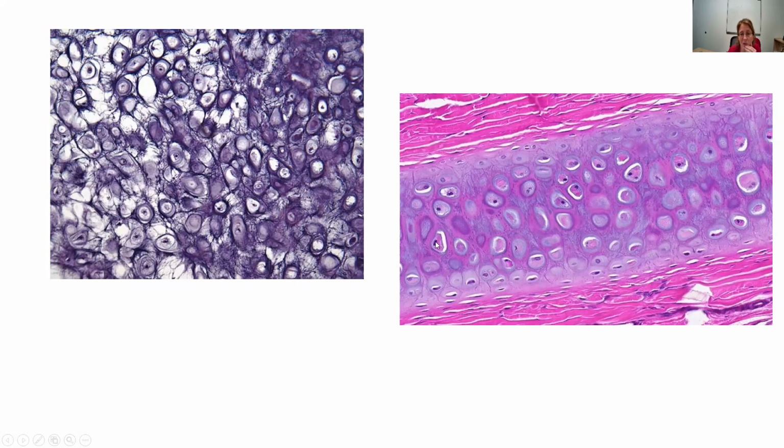If this was neural tissue, I wouldn't see this many neurons this close together. They're a little bit bigger, they're a little bit spread out, and they're definitely not circular shaped. I might have one or two, but I'm not seeing those shapes that look like they have arms and legs or little stems coming off. So I got to throw out the neurons too. So I'm down to connective tissue.